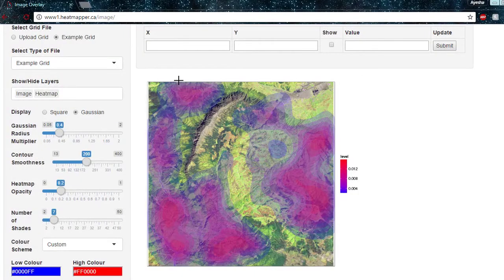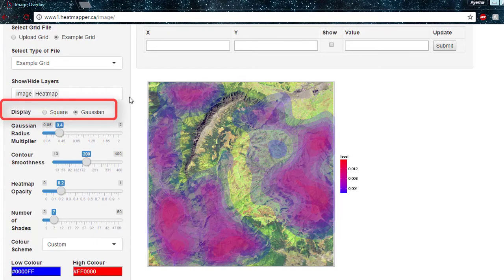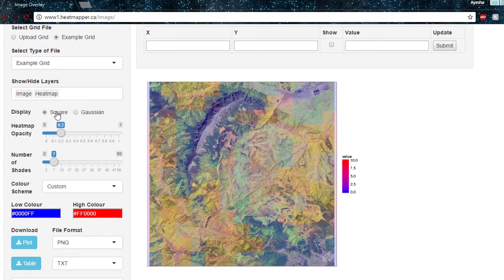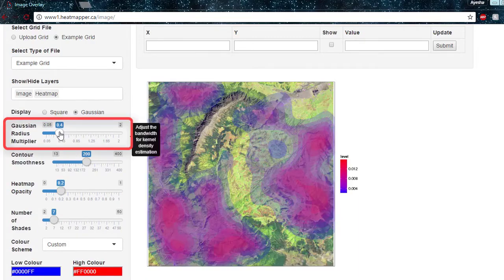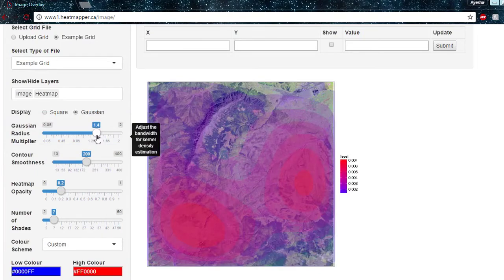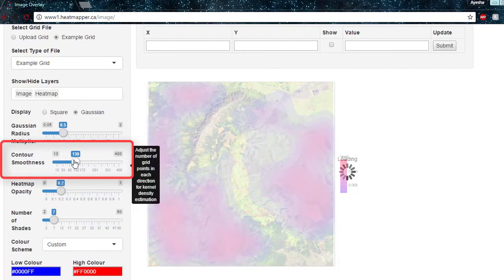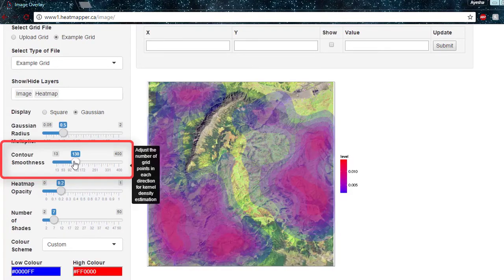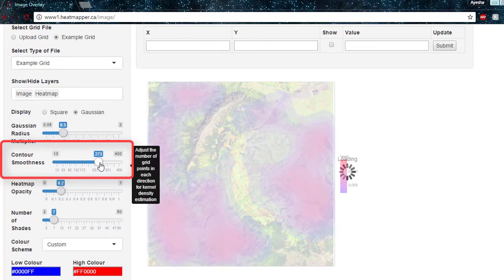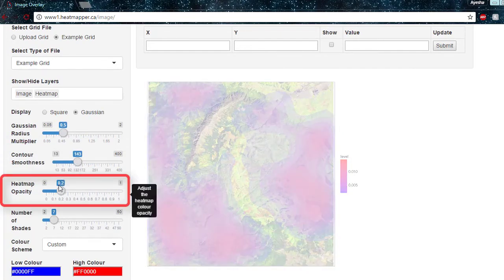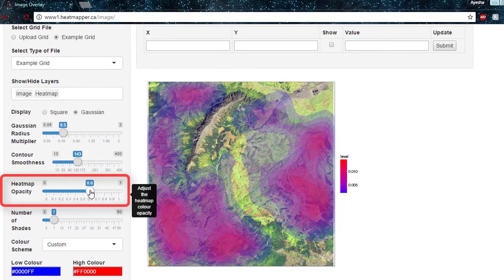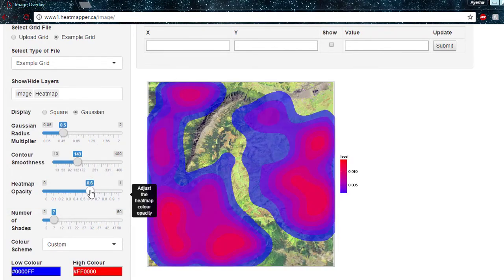Using this example, let's take a look at some of the options available. The display option allows the user to choose the distribution for the overlaying grid. The default is Gaussian, which smooths the distribution, while the square option does not. The Gaussian Radius Multiplier option allows the user to adjust the bandwidth for the kernel density estimation — a higher value smooths the graph further. The Contour Smoothness option adjusts the number of grid points in each direction for kernel density estimation. The Heatmap Opacity option adjusts the opacity of the grid overlay, where a higher value more clearly displays the heatmap distribution.